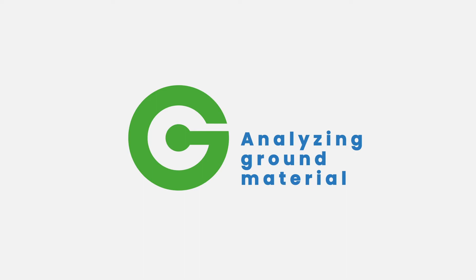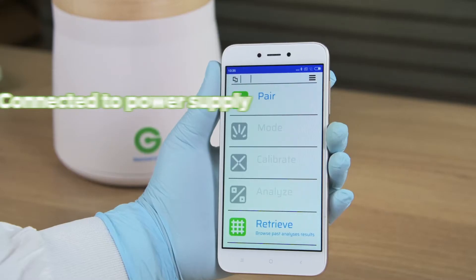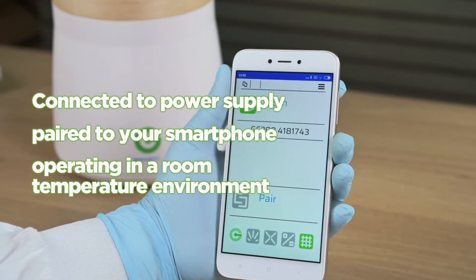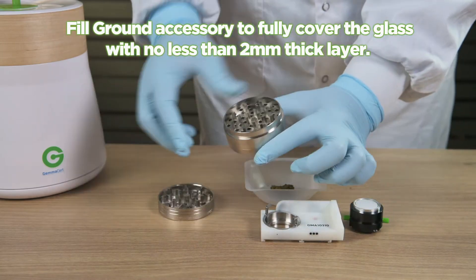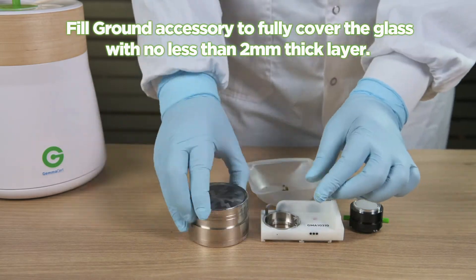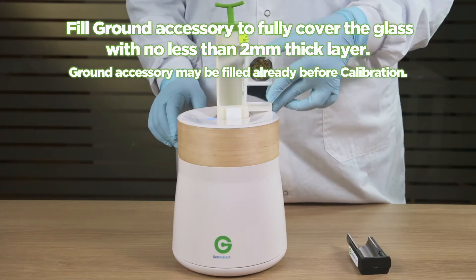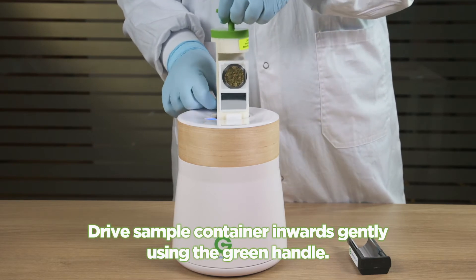Before analyzing ground material, make sure your GemAssert device is connected to a power supply and paired to your smartphone, and that you are operating in a room temperature environment. Fill the ground accessory to fully cover the glass with no less than a two millimeter thick layer. The ground accessory may be filled already before calibration.